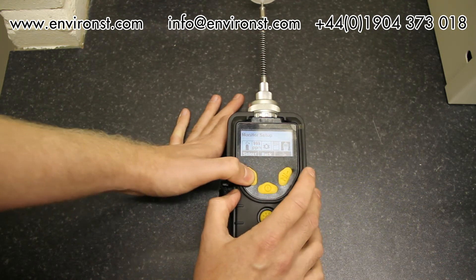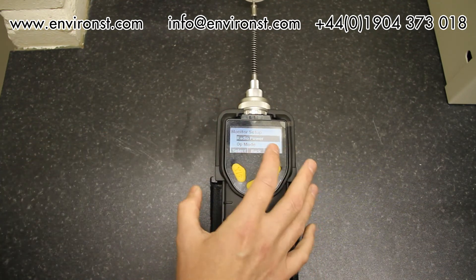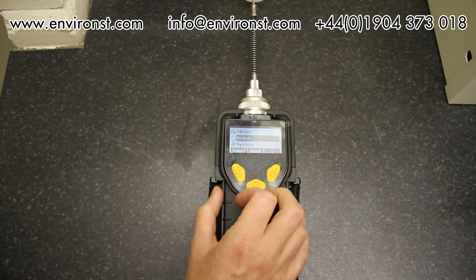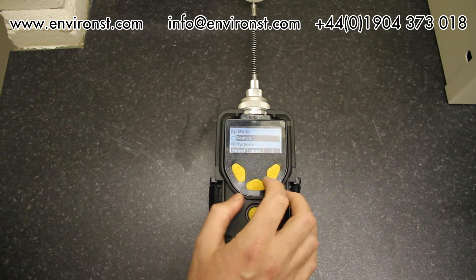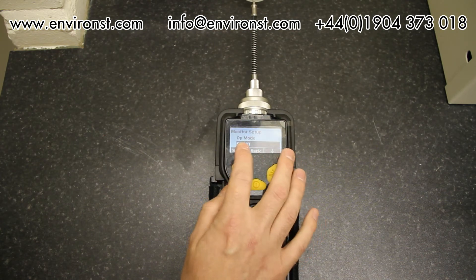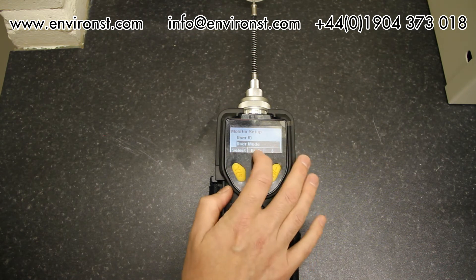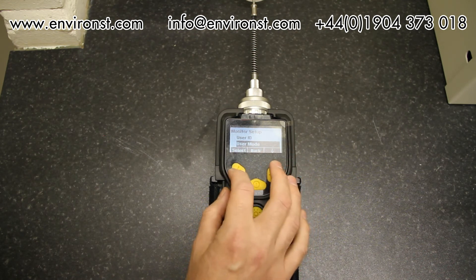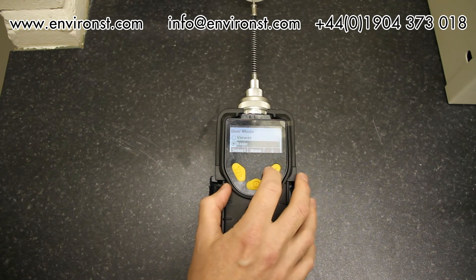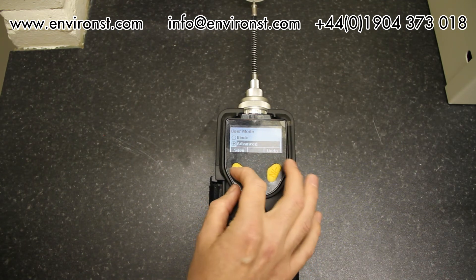Scrolling across to monitor setup — this is where I can turn radio power on and off, and change the operation mode. Selecting that gives search mode or hygiene mode. You can also enter a site ID, a user ID, and set a user mode: viewer, basic, or advanced. I'll put it into advanced and save.